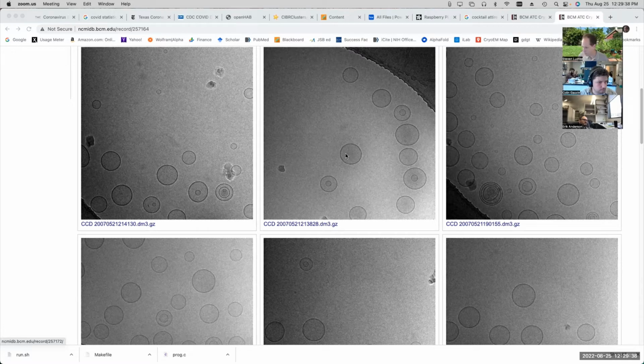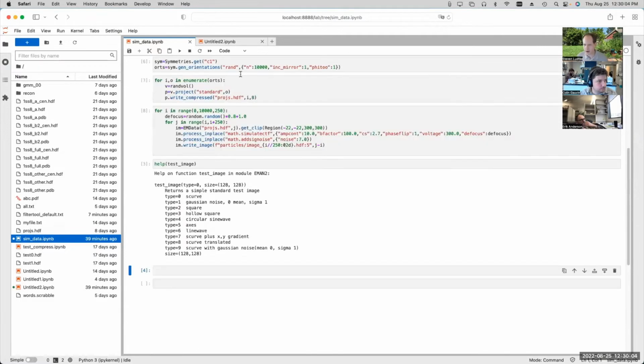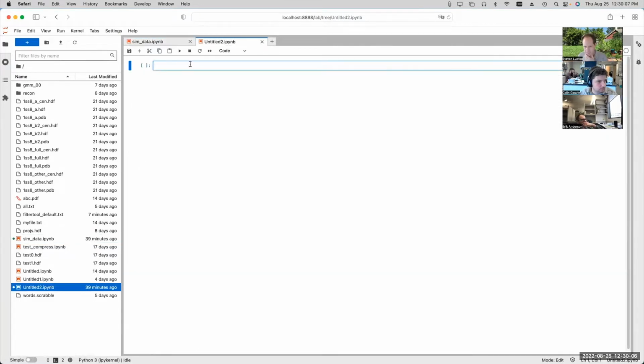So I think what I would do is take flat band random noise and apply some sort of a filter, a band pass filter, something like that, to produce texture in the noise, then mask it out, and then merge that masked noise with a different background signal. Right? So what I'm producing is a difference in texture rather than a difference in image. So maybe we can try doing something like that. I haven't really tried this before, so we'll just see what we can come up with. So let's try.